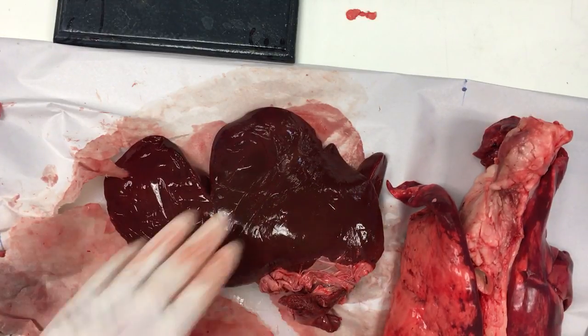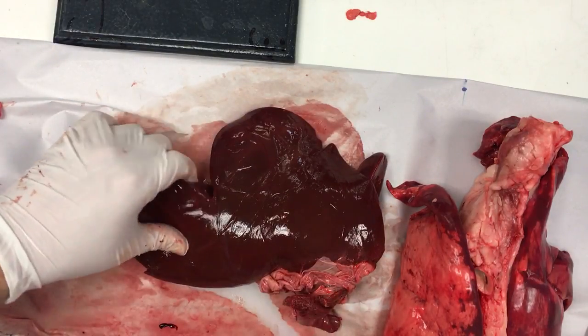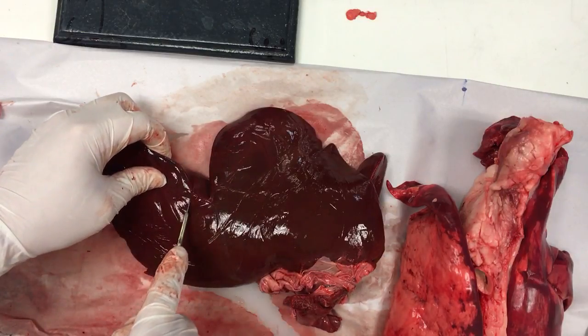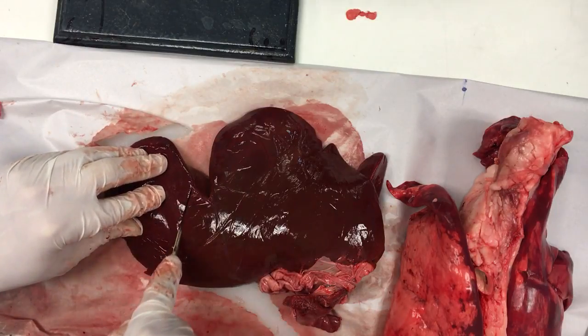So this is a liver — this is a sheep liver. You can see the different lobes. Liver is used mostly for processing a lot of your stuff. If I just cut through here... it's really soft, it feels like jelly. Like it really truly feels like jelly.